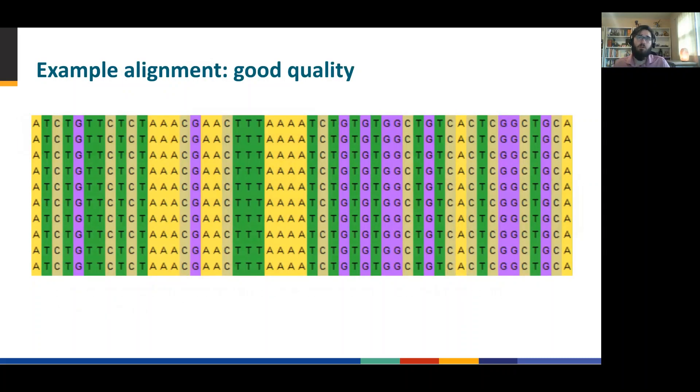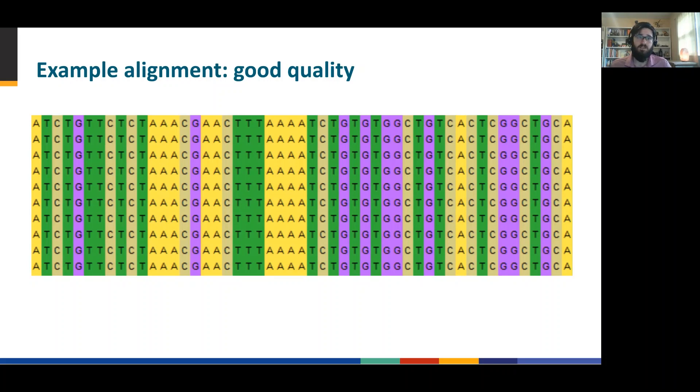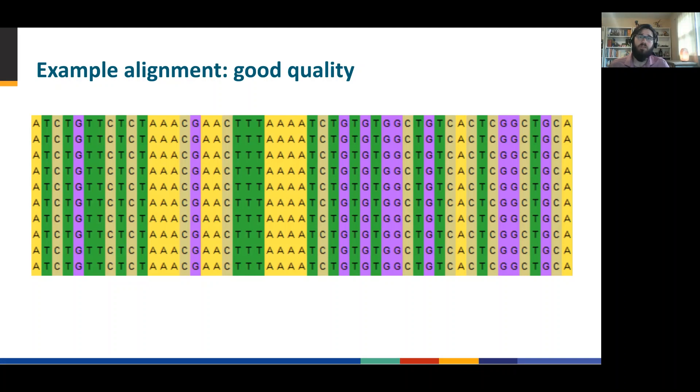I'm going to give you an idea of what a good quality sequence alignment looks like. You can see that while all of these sequences are actually identical, they're comparable. Everything is in line.